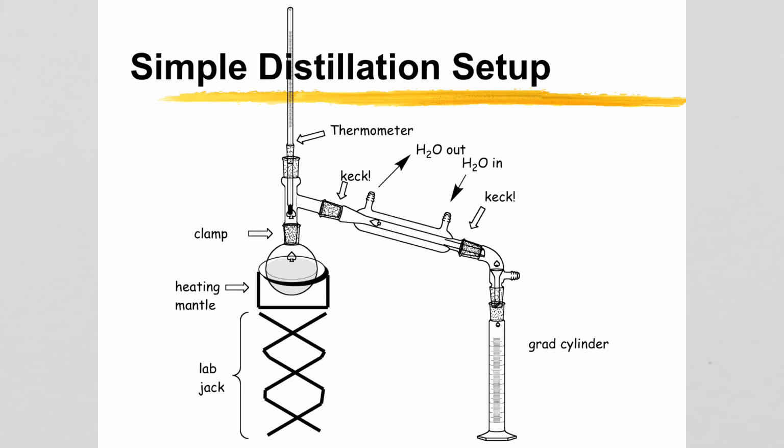Here is your simple distillation setup. I just want to make a few notes of where this is different from the one that was described in the MIT video, and I know that she said in the video that this is the most complicated setup you'll do, and it is a little complicated, and it's going to be complicated the first time, but don't worry, you're working in groups, and also we're there to help you, and you'll be able to figure it out.